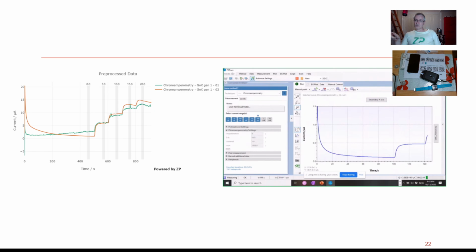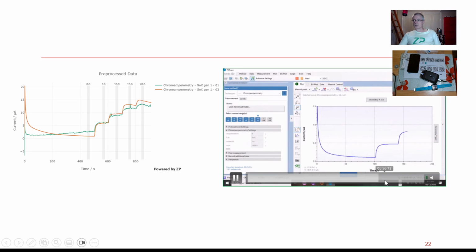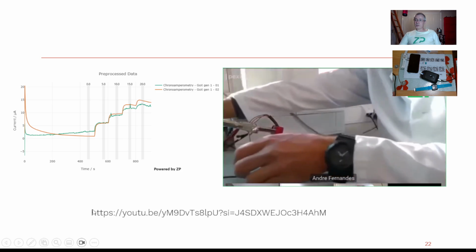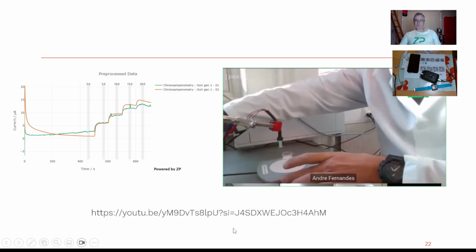So you need to be able to repeat this experiment several times and convince yourself that your setup is good, because if you can get all this working, that baselines you before you bring in the trouble of the microneedle setup. He does it quite a few times, and I will put a link to that YouTube video underneath this video.